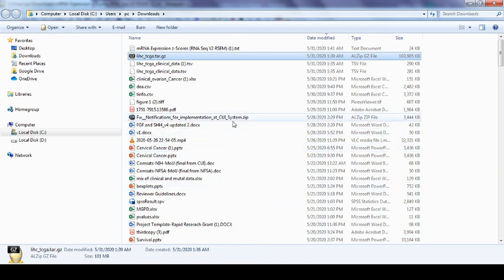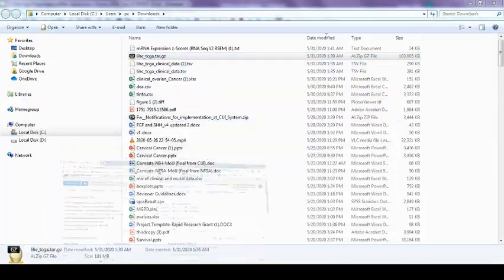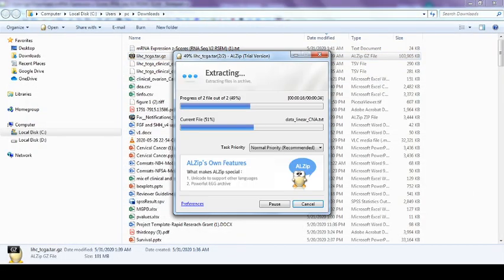So let's see why it's not done yet. Okay, wait, let's see. Okay, so waiting is always very difficult.